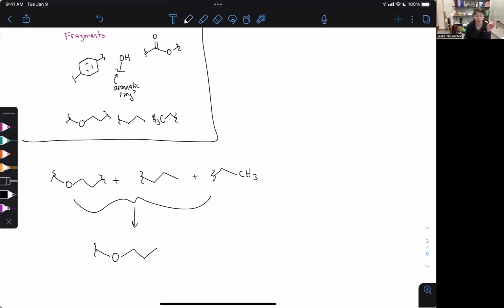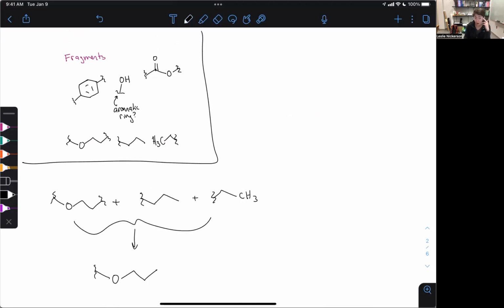Okay. And that's something that part of it comes with practice, part of it comes with just being willing to take a guess and see what happens. So the whole process that we're doing here, we can't guarantee that we're going to be drawing the right product right off the bat. We need to be a little bit more comfortable with trying stuff out, doing guess and check, going back and looking at your data and seeing if it fits. Okay, that's what we're aiming for. So we might be able to get away with putting all of these fragments into one piece.